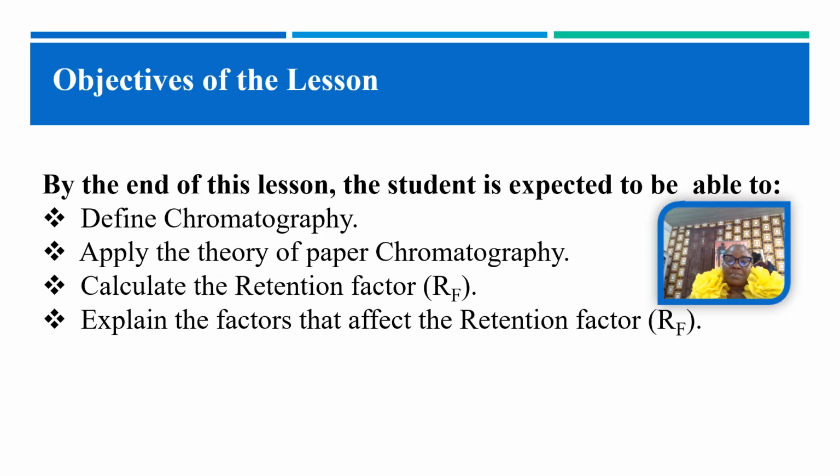Objective of the lesson. By the end of this lesson, students are expected to be able to define chromatography, apply the theory of paper chromatography, calculate the retention factor, and explain the factors that affect the retention factor.